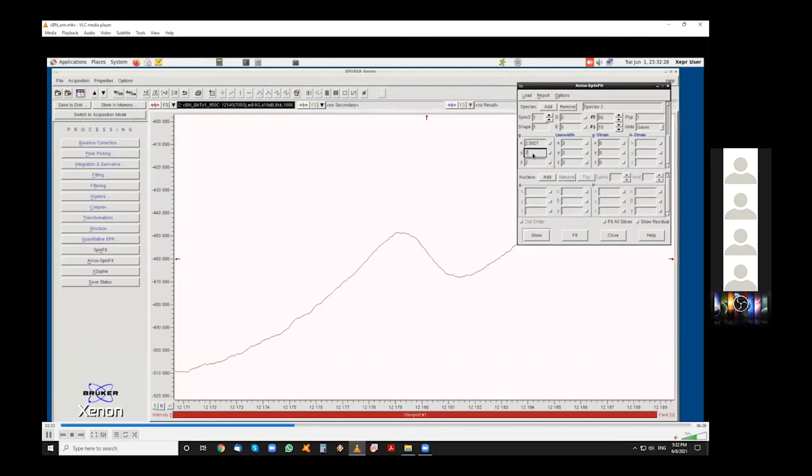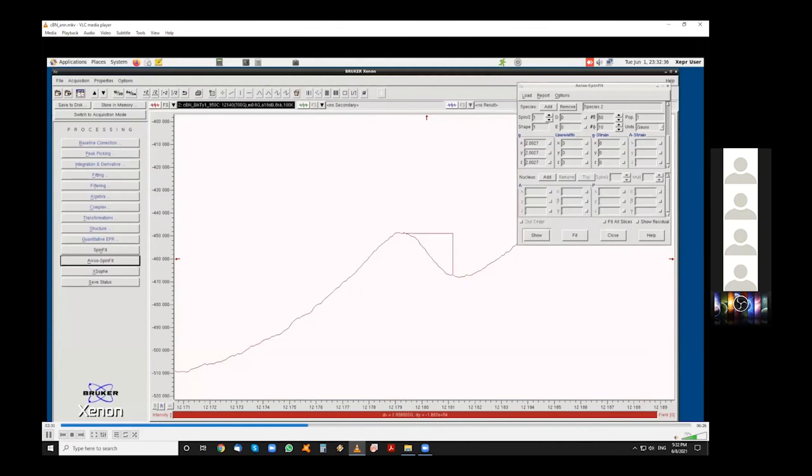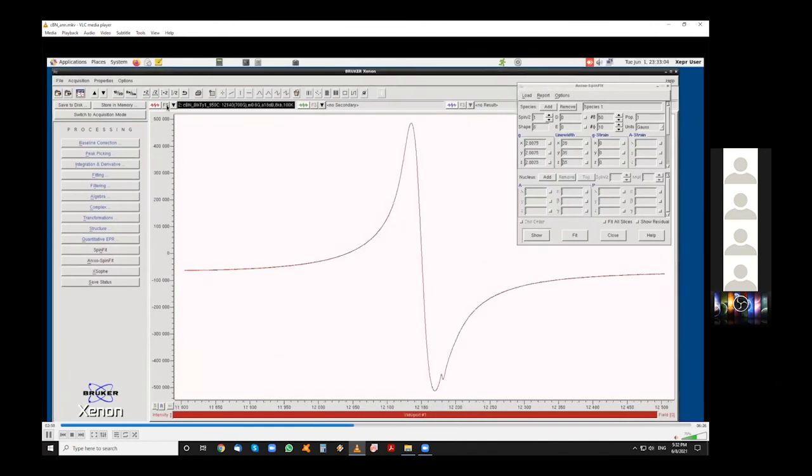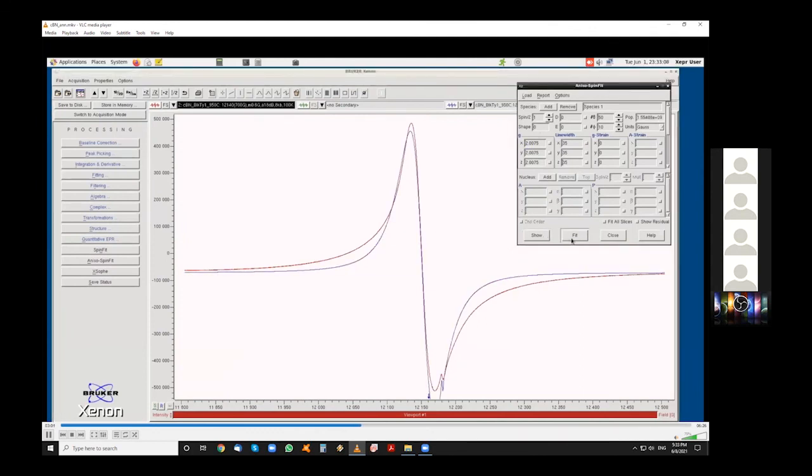You may observe from this spectrum that the centers have different behavior with the annealing treatment. I will go a little bit further because you already saw how we do the same part. And we will optimize all the parameters at once.